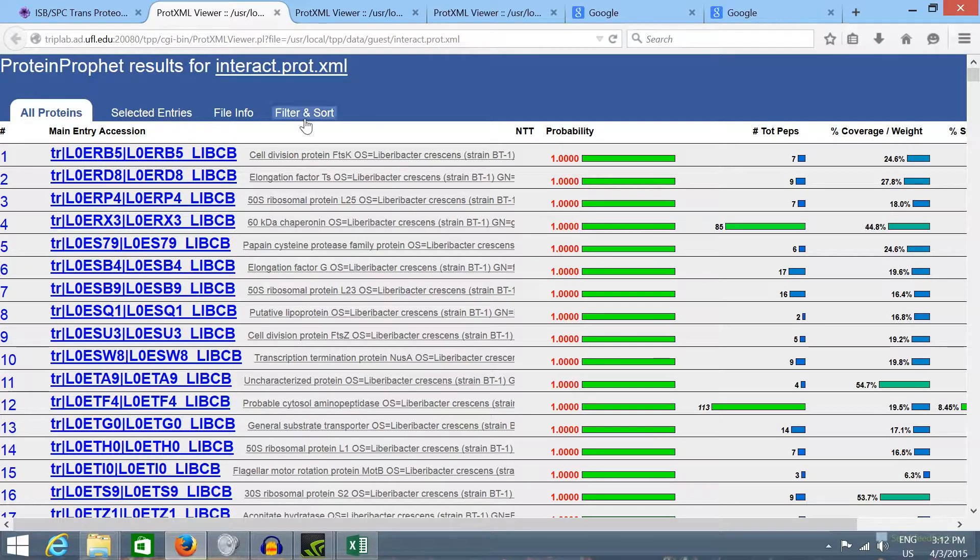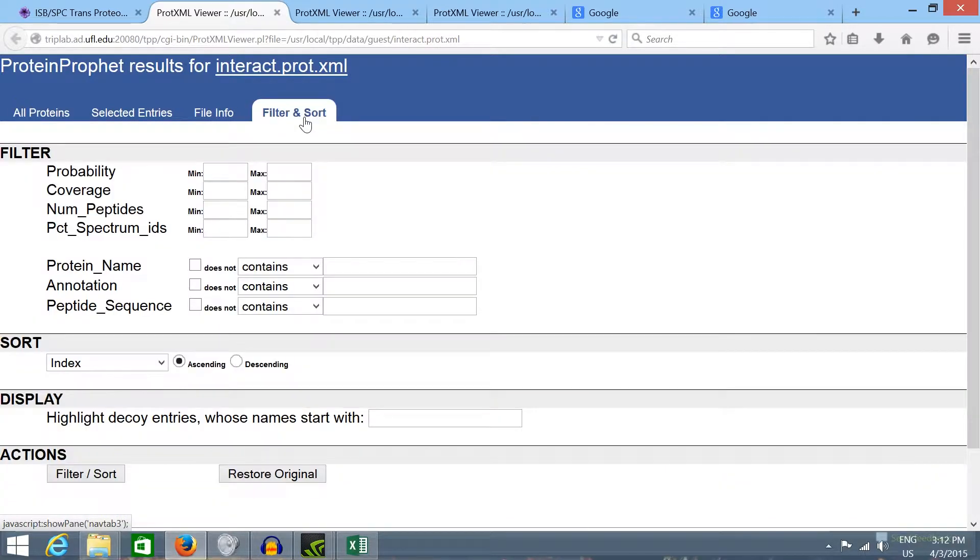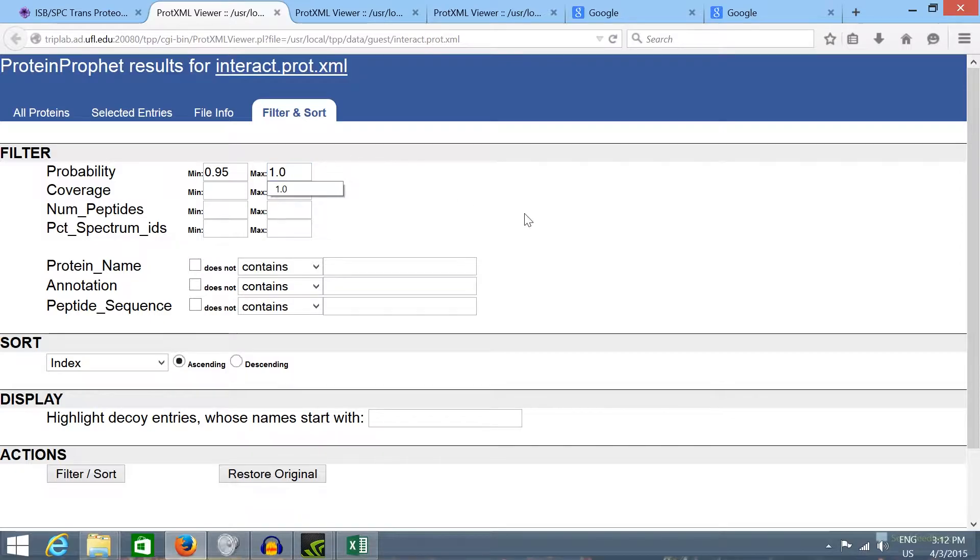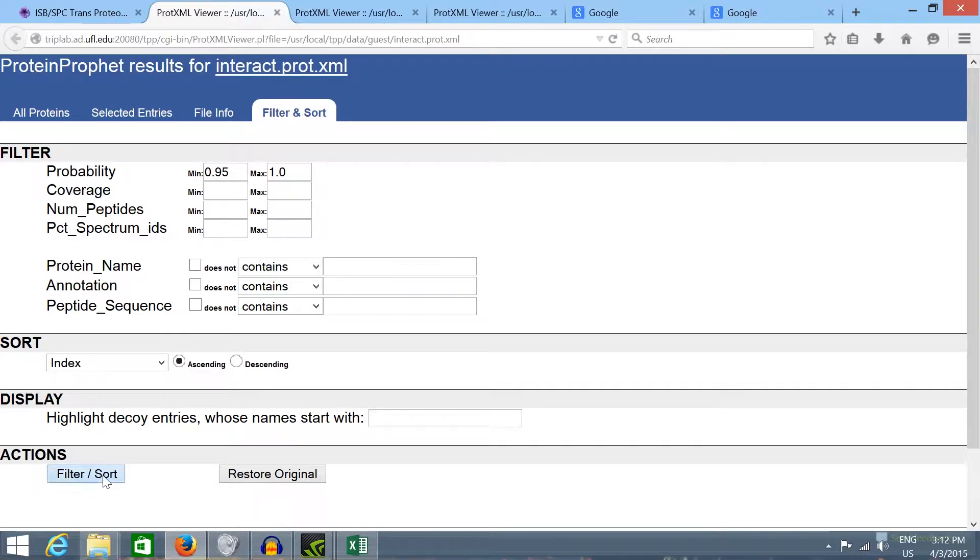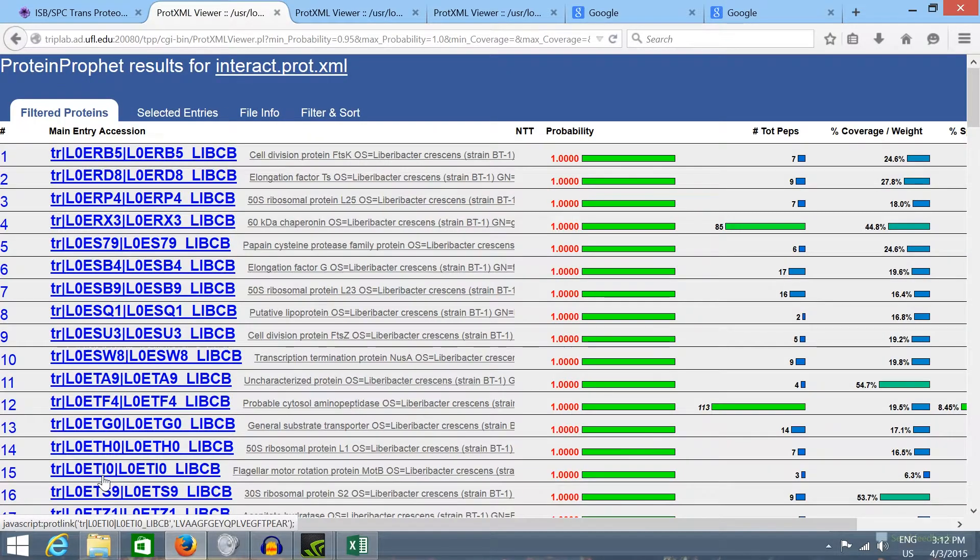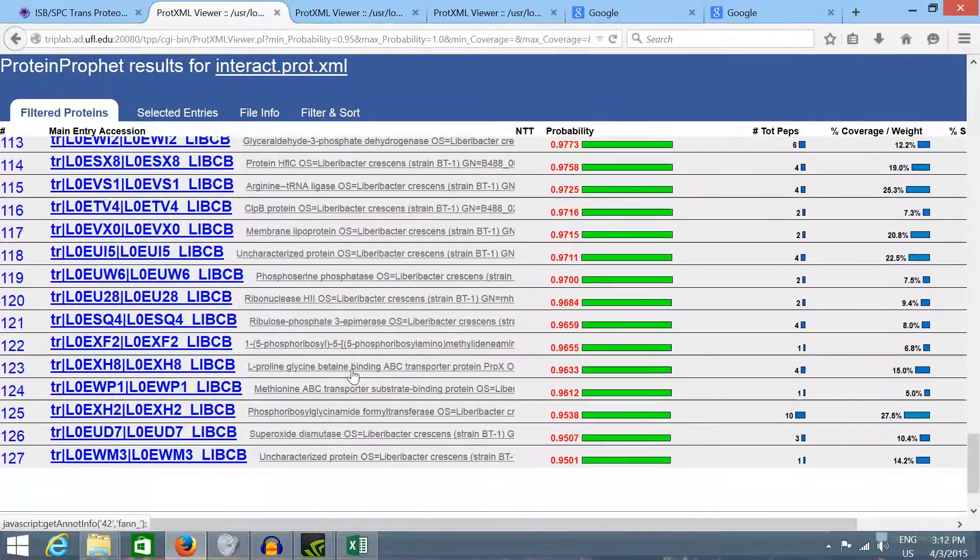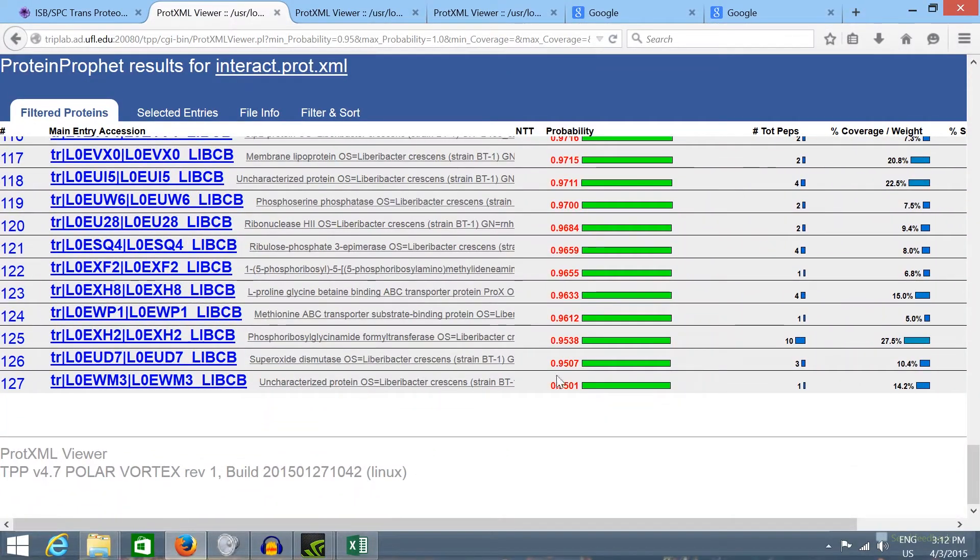In the sort filter tab we can select a probability range to refine our results. So I'm selecting a minimal probability of 95%. If you click in sort the results should be refined to a minimum probability of 95% now.